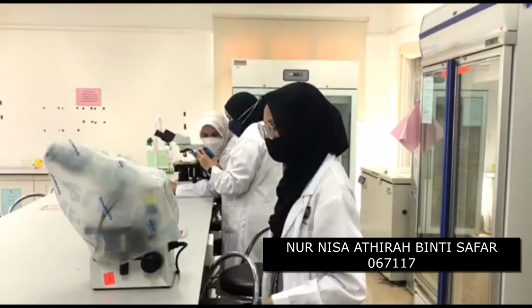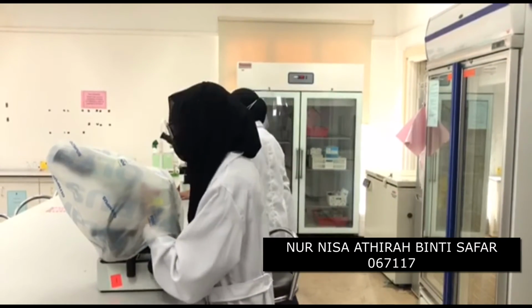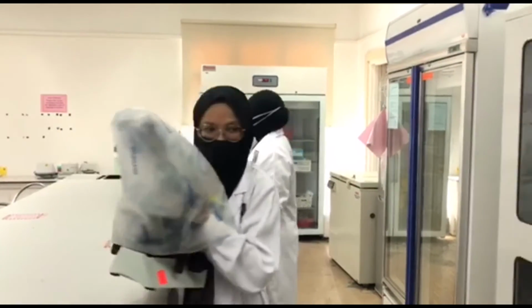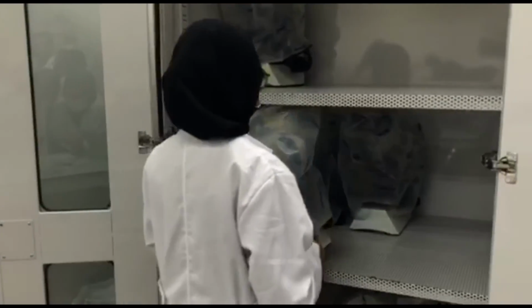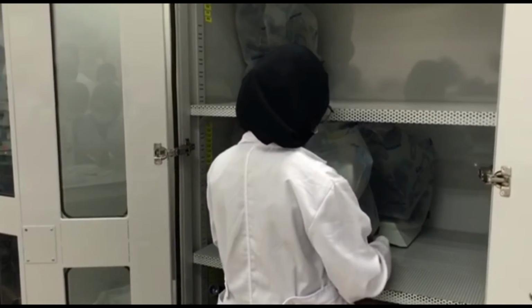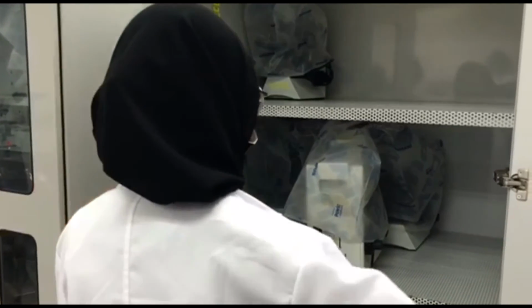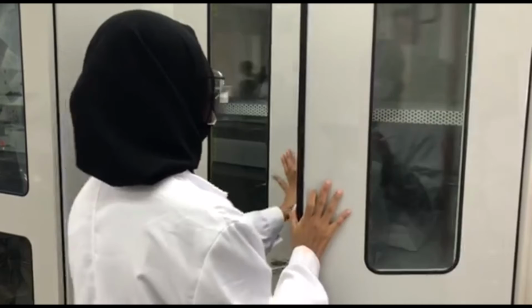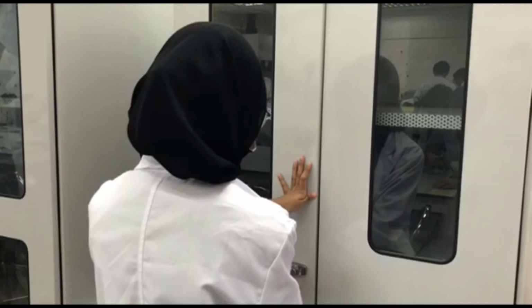Whether transporting or storing your microscope, even stored in a cabinet, always keep your microscope covered. Why? Any dust fallen in the light path will interfere with the quality of the microscopic image. Make sure you store your microscope in a clean and dry space with good air ventilation. Moisture may corrode the metal parts of your microscope and allow mold to grow inside the microscope.